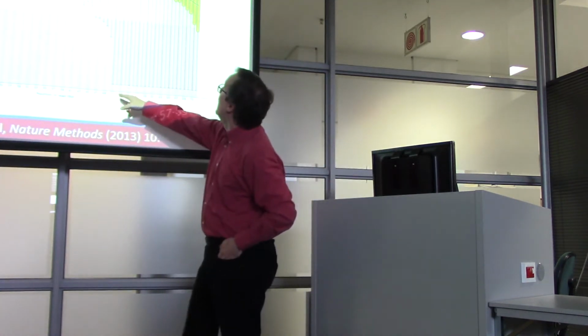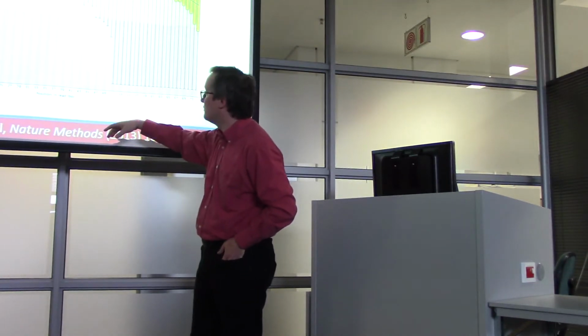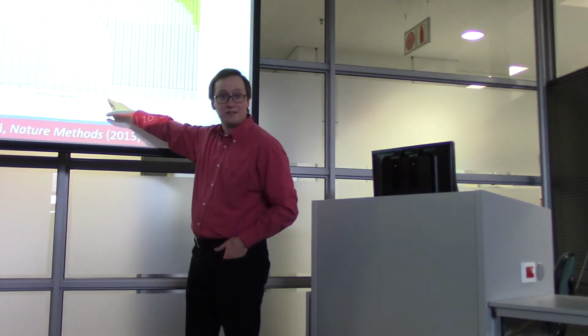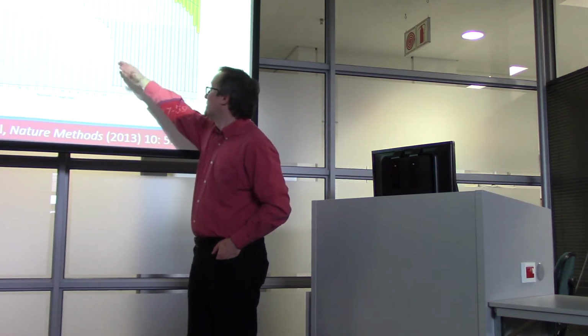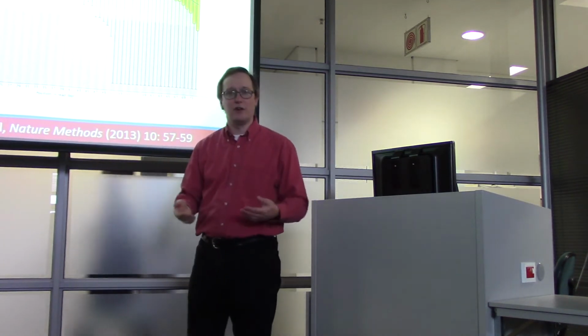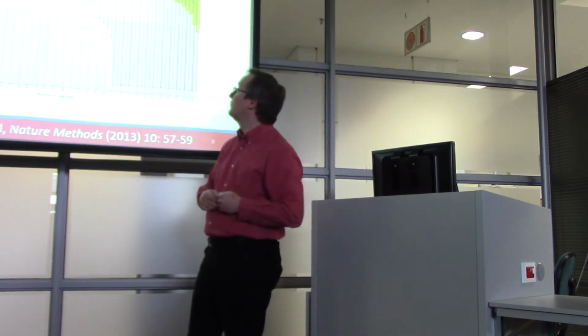In this case, we're working with Illumina 1.9 encoding. This is some Illumina sequencer, and it's producing short reads. The reads here are about 50 base pairs in length, when suddenly the probability of error has risen when we're looking across all of the reads that we have for the sample.